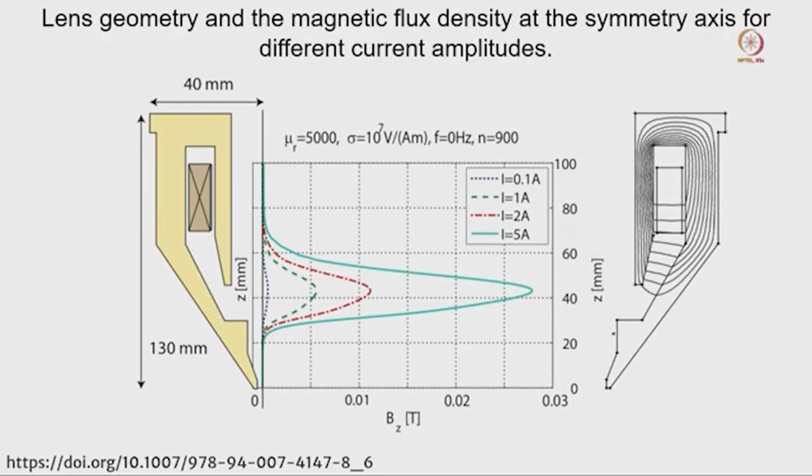So, now that magnetic field is very important, because that is the part that is going to regulate the movement of the incoming electron beam. Let us consider the two magnetic lenses we are showing here. You can see this is the gap and the magnetic field is coming out in this path, and now there is an incoming electron. You can see how they simulated this to show what magnetic flux we can expect and what kind of movement we can expect for our incoming electron beam.